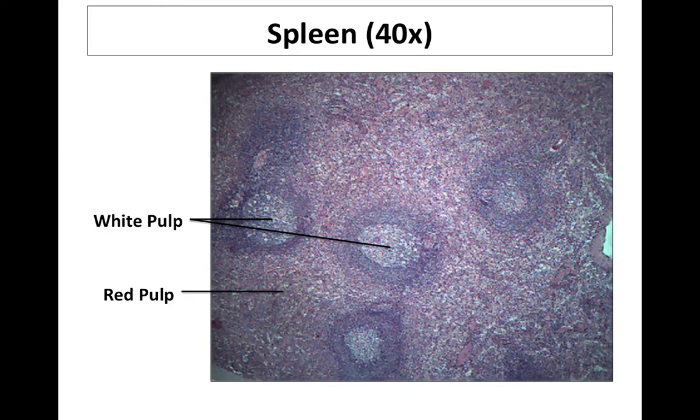So of course, as we move from respiratory into lymphatic, you can see the spleen. Right? The spleen in itself is going to be a combination of immune function as well as blood function. And we divide these up into different layers. So to begin with right here, you can see what's called white pulp. Now, ironically, it is purple, but it is named because this is where you tend to see most of the white blood cells, leukocytes, and those just tend to stain purple. And so that's why you see purple wherever the leukocytes are clustered.